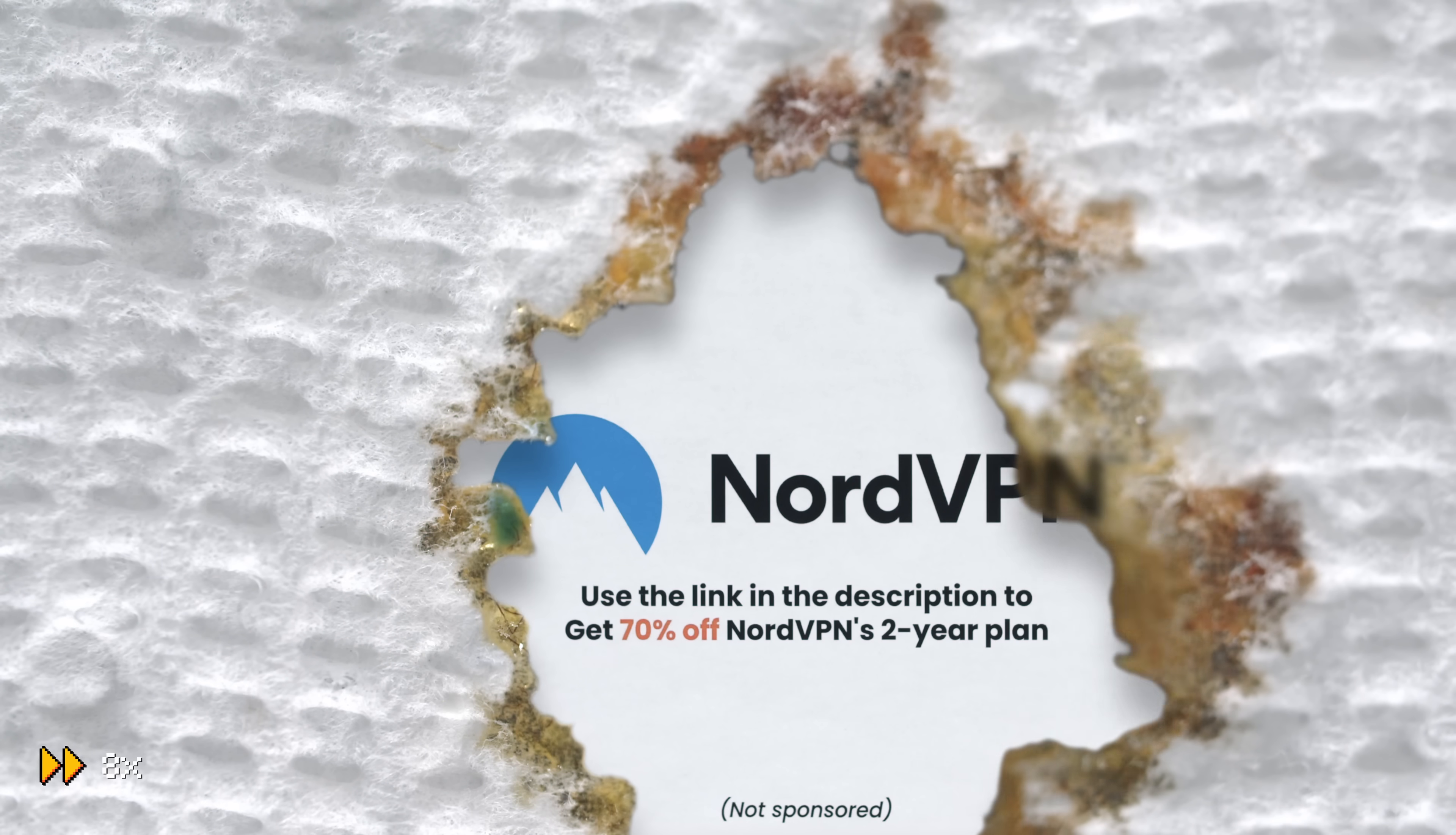This is sulfuric acid, and this is what would happen when it drips onto a piece of paper.